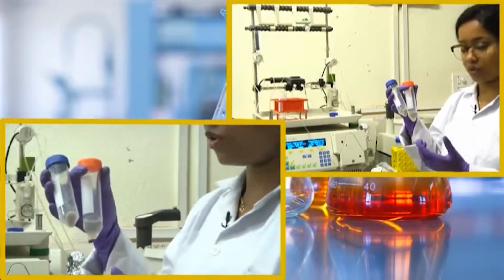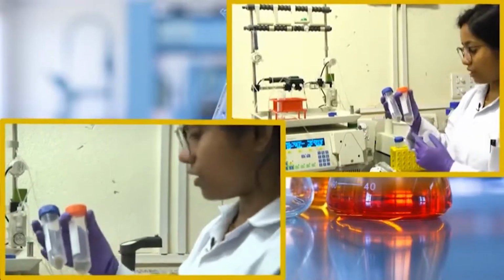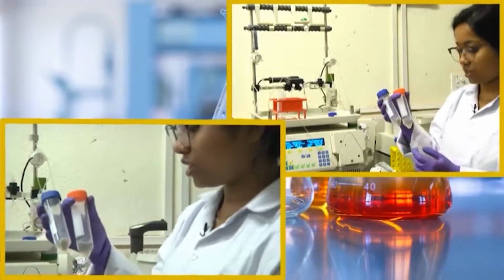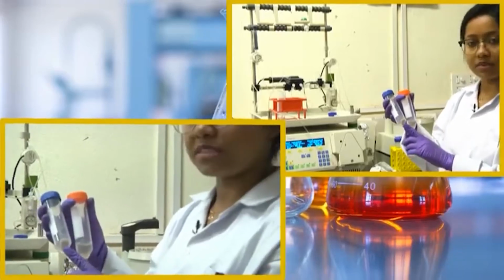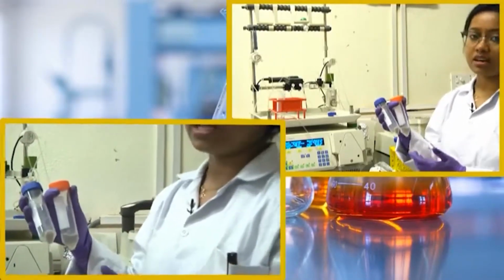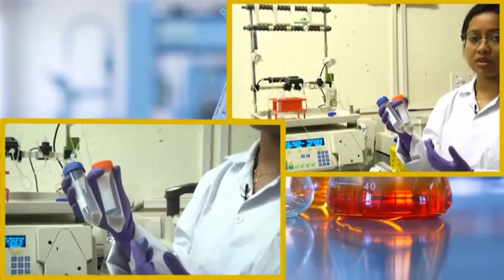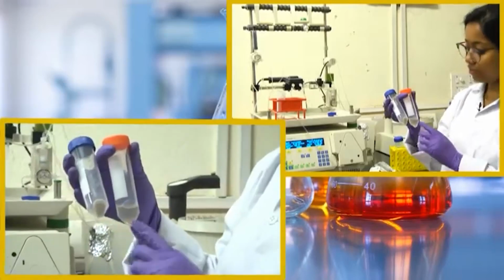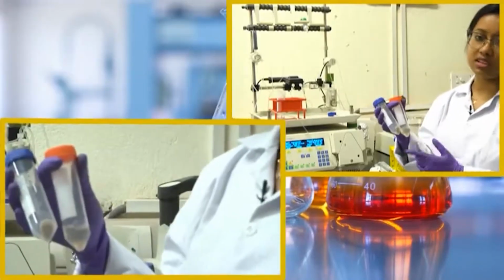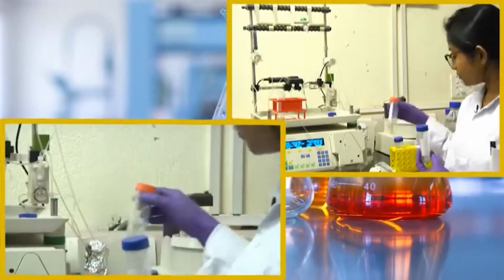In that case, after running the centrifugation, you can take a small amount of sample from here and a small amount from here and run an SDS-PAGE gel. That will show you where your protein of interest is present. If it is present in the soluble fraction, then it is easy. You just run the soluble fraction through this column.